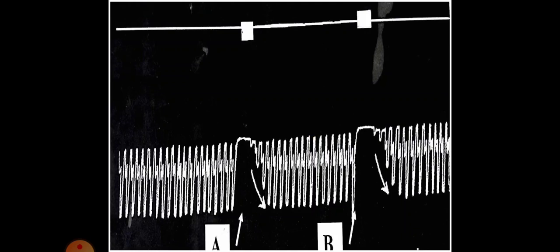On the top you see a line with 2 marks. That mark is a point of stimulation. So this is actually the EMTM, electromagnetic time tracer, or time marker.